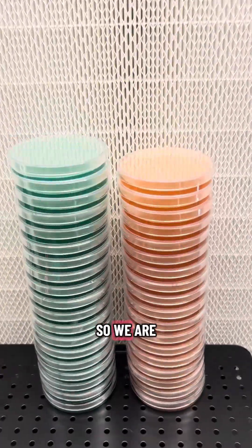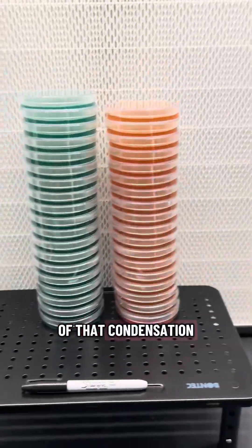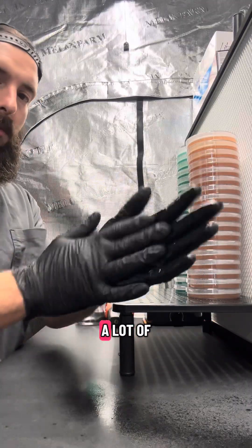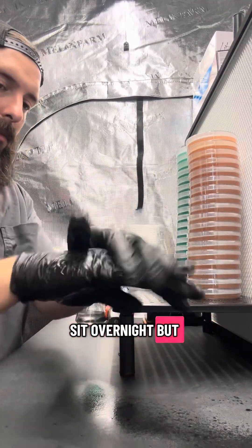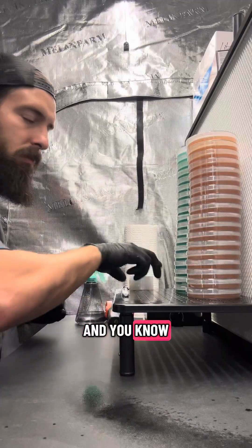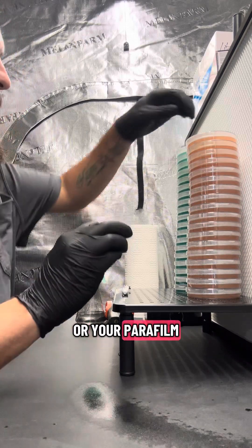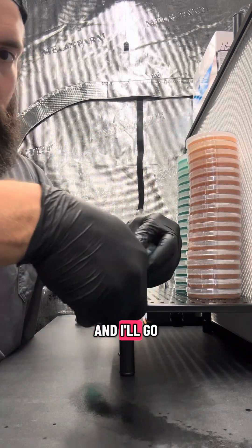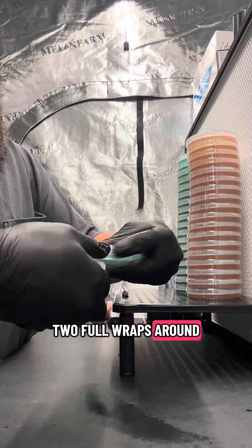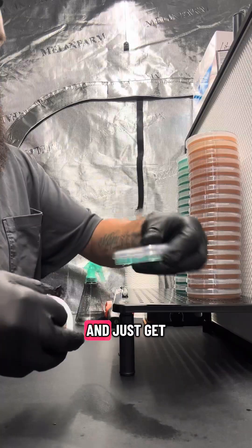We are done pouring and we're going to let this sit in front of the flow hood to get rid of some of that condensation. It's been around an hour, so I'll go ahead and start wrapping these plates. A lot of people let them sit overnight, but I ran into some issues with that and I honestly don't mind a little bit of condensation — after they sit for a couple days they look just fine. Get your grafting tape or parafilm, start at the top of the stack, and make two full wraps around for one added layer of protection.